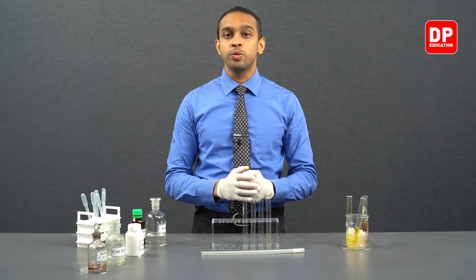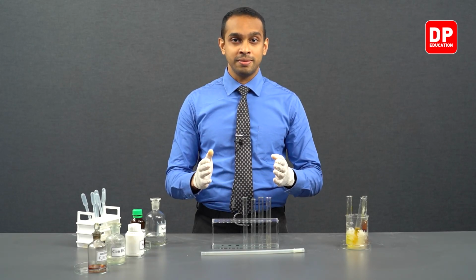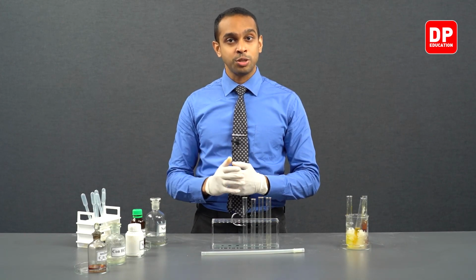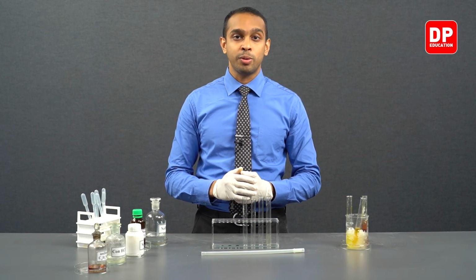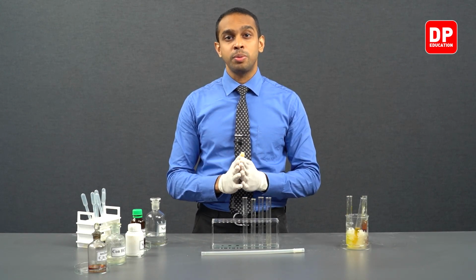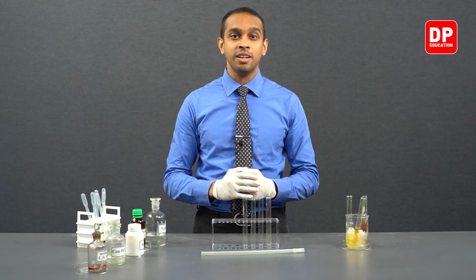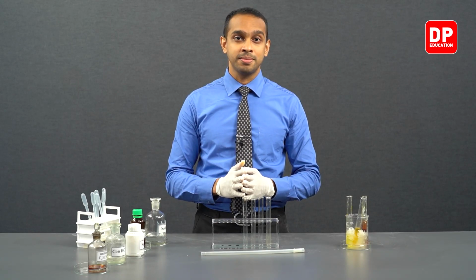Then we moved on to adding concentrated hydrochloric acid to aniline. Aniline is a base and therefore it reacts with the concentrated hydrochloric acid, forming anilinium chloride, which is going to be a water-soluble salt. So upon addition of HCl, we saw that aniline dissolved in HCl.